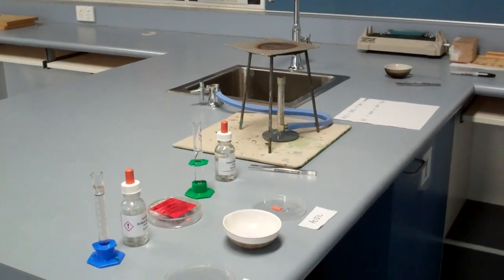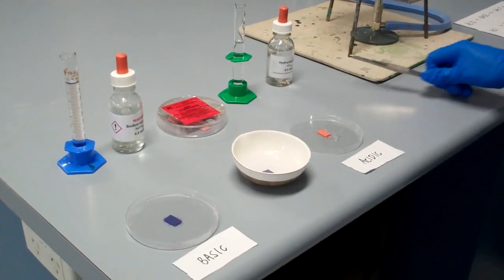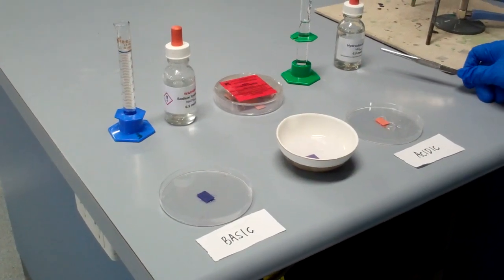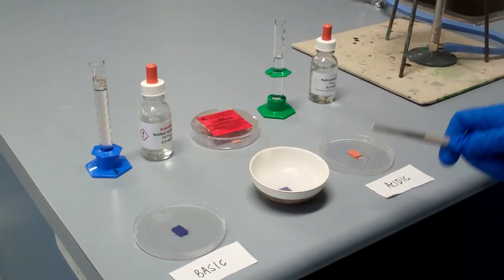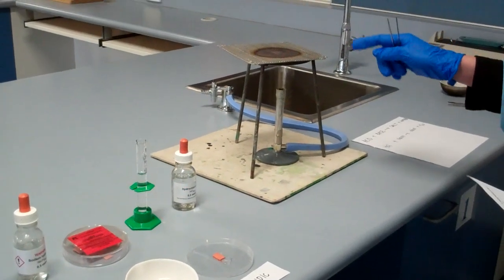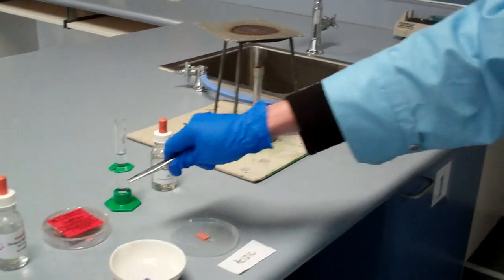Alright, today we will be looking at neutralization reaction. So in this practical, the materials that we are using are 0.5 molar sodium hydroxide and 0.5 molar hydrochloric acid. We will use litmus paper, evaporating dish, tripod stand, gauze mat, Bunsen burner, bench mat, and tweezers, and of course litmus paper.